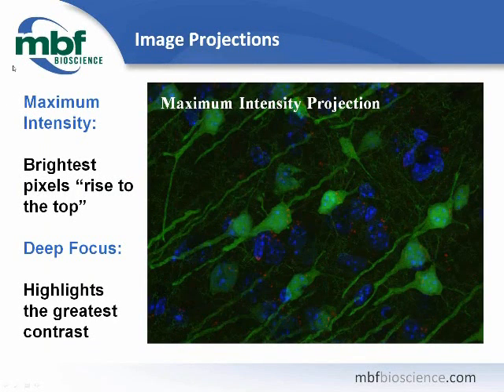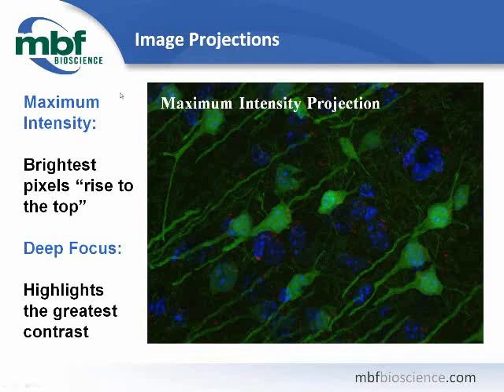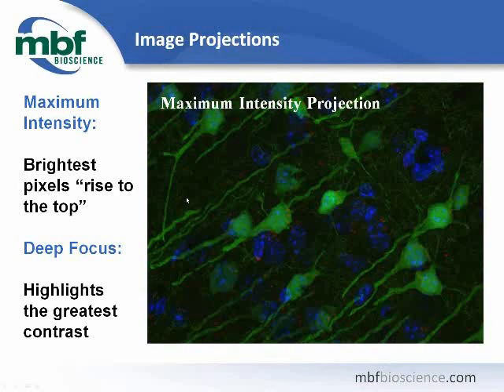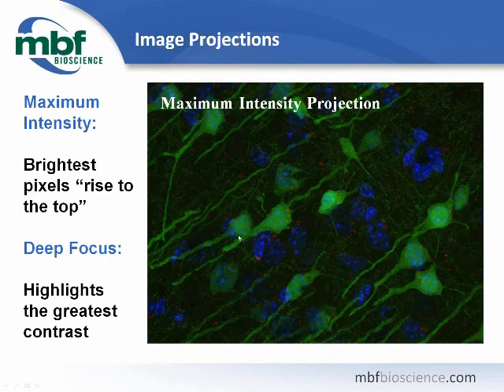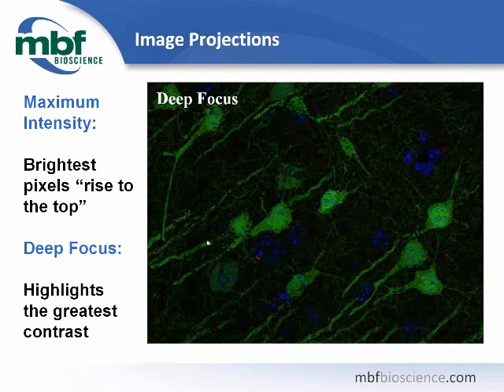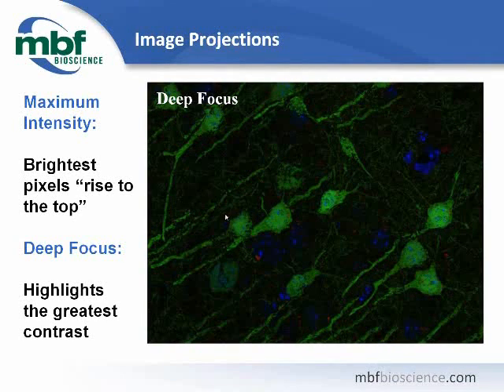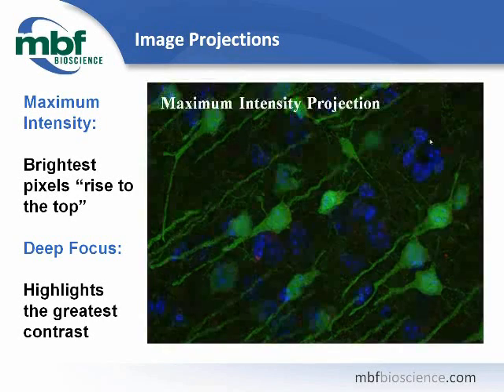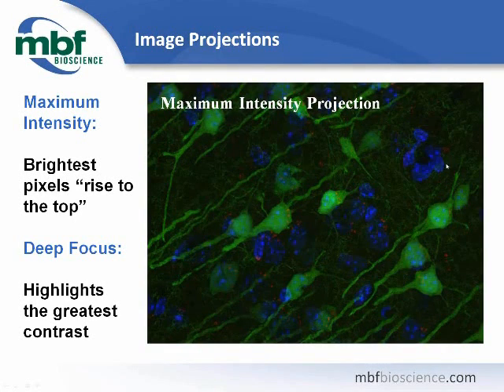When you have an image stack, you can also create projection images helpful for presentation or publication. The maximum intensity projection brings all the brightest pixels from the stack to the top when the image is flattened, so each individual channel's brightest pixels create the component image. Contrasting that is the deep focus projection, which highlights areas of greatest contrast — particularly useful when you have very punctate regions of label. You can choose which projection you like and save them independently of the image stack.